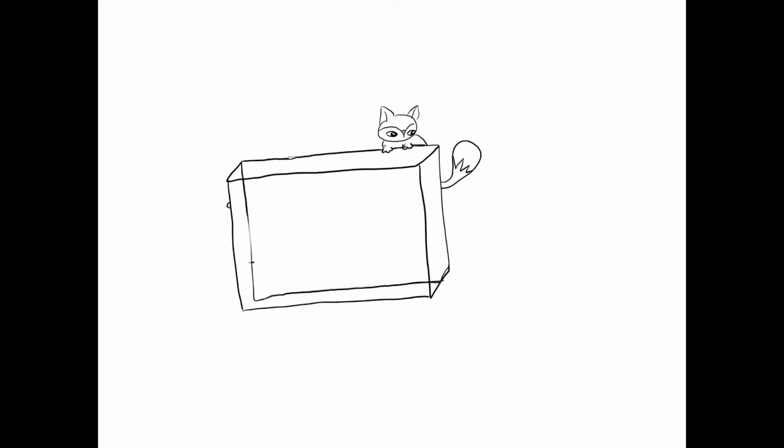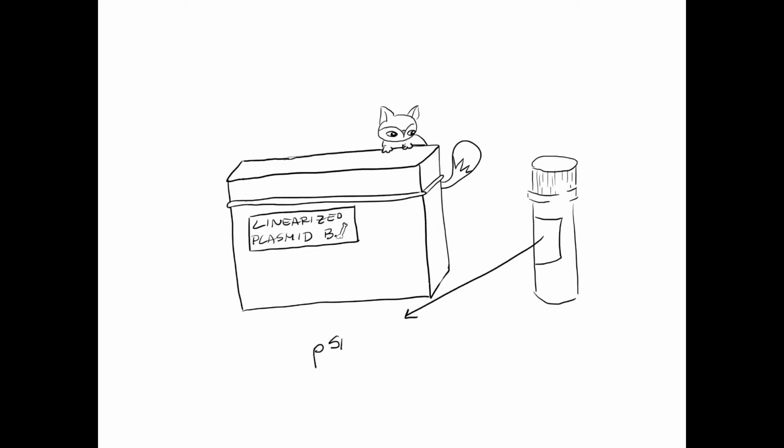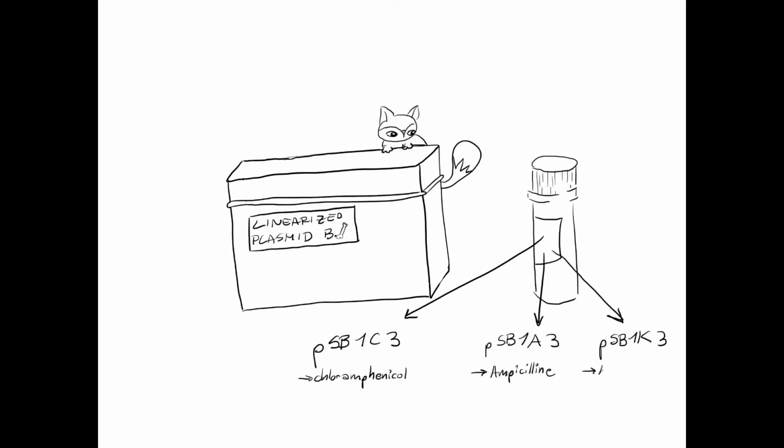Linearized plasmid backbones. These should be stored at -20°C. In this little box, you will find the biobrick plasmid backbones pSB1C3, pSB1A3, pSB1K3. The letters here stand for the different antibiotic resistances that they carry. C is chloramphenicol, A, ampicillin, and K, kanamycin.